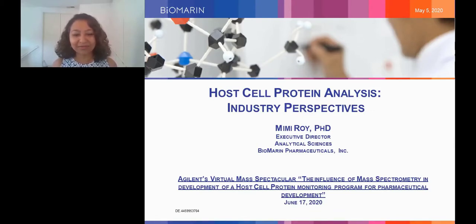So the influence of mass spectrometry on host cell monitoring has been tremendous. The advances in mass spectrometry can be compared to advances in how our cell phones have evolved over the last decade, and there are so many new things we can do with these technology advancements. So how can we use this technology for the analysis of impurities which are coming from the host cell that is used to manufacture a biologic?